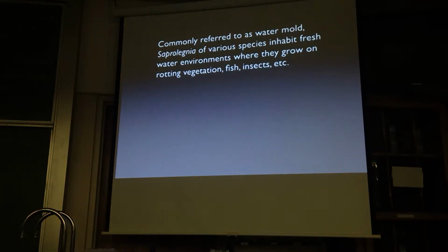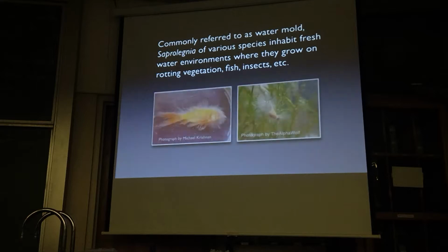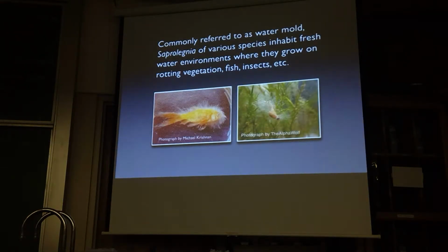So you have 2 examples here. Again, water mold. The reason this is called water mold is because it looks like a fungus, but it's in the water. So some of the newer references are saying these aren't really fungi. We're going to call them fungi in here because the phylum, Oomycota, is a fungus phylum. That ending doesn't fit in the protista category. There is a tube up here at the front that has water mold in it. Actually, it has water, and then it has some seed material, and what looks like a lot of fuzzy stuff. It's the hyphae of the fungus.